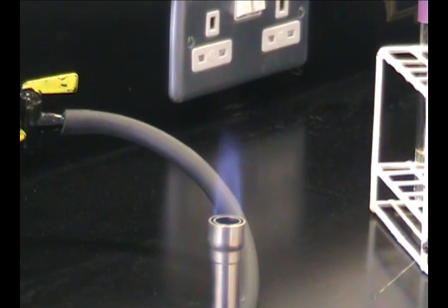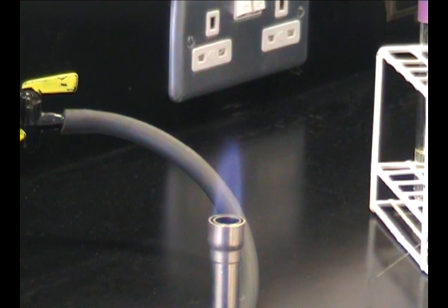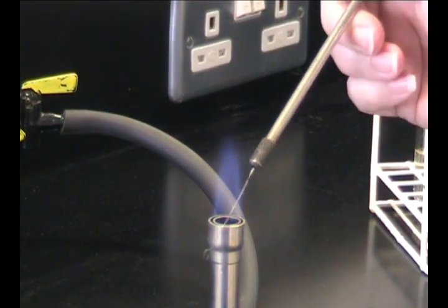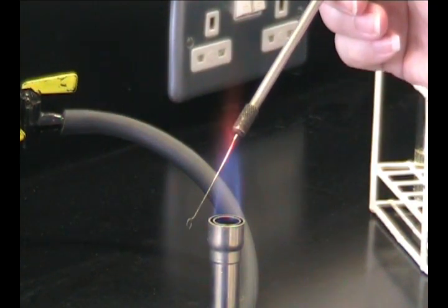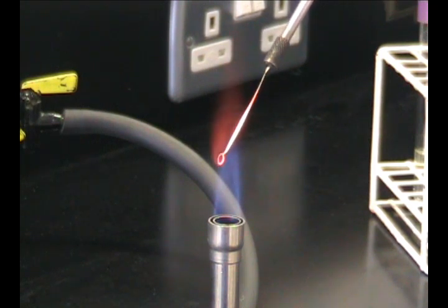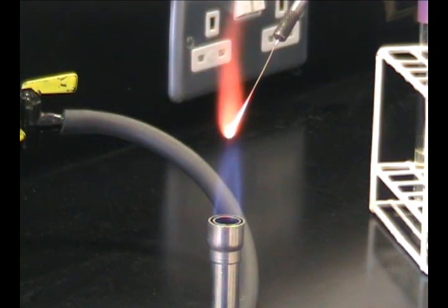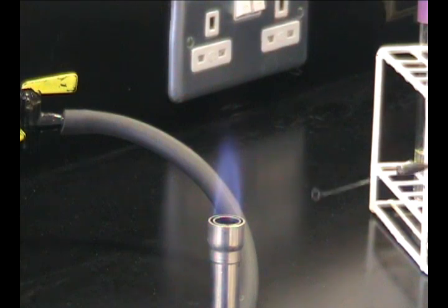Before you start work, the first thing you need to do is sterilize your loop. Pass your loop through the flame, pulling it up through the top of the blue cone until it glows red hot. Remove it from the cone and allow to cool. Do not put it down on the bench.